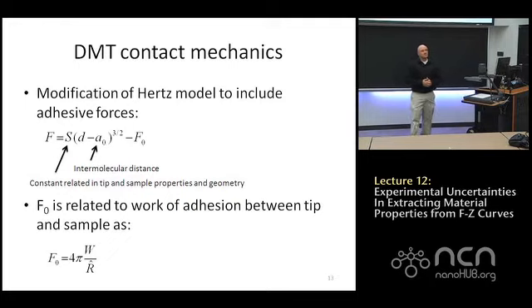Just to close my idea: with the DMT model, what I am doing at the end is fitting a curve. Yeah, at the end of the day, we're going to fit a curve.